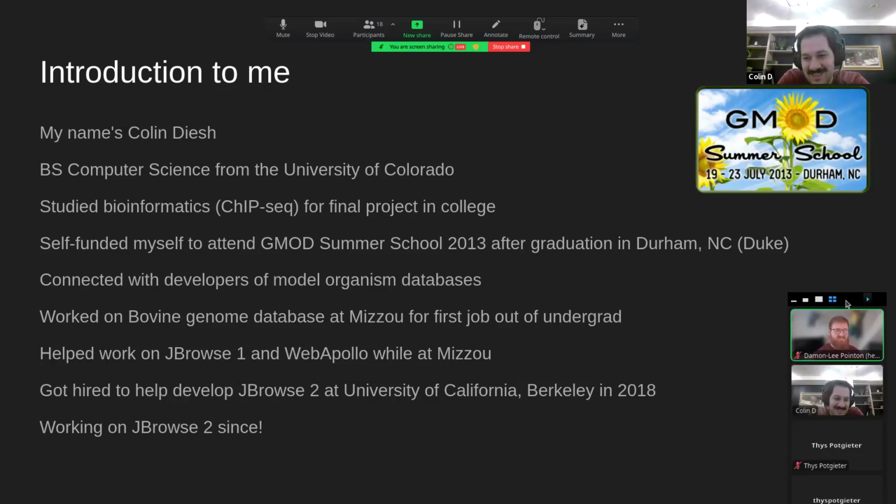And I got hired to do JBrowse2 as a big rewrite and adventure into this project I'm going to tell you about now. It's been a 6-year-long adventure now, and it's been really cool.